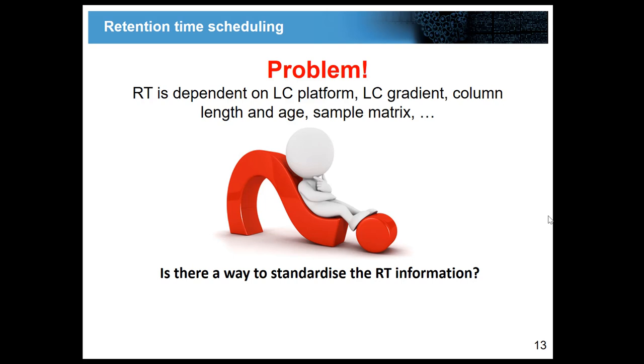But let's assume we have 2,000 peptides or 1,000 peptides, or let's say we have 100 peptides that we always want to monitor. So you would always need to reshoot all those 100 peptides to find out. Do 3 points: early RT, middle RT, and late RT, and just check those 3 points. Yeah, that's also a very good point. Do retention time indices. Exactly. Another way is, you are absolutely right. In a way, you describe exactly the same thing.